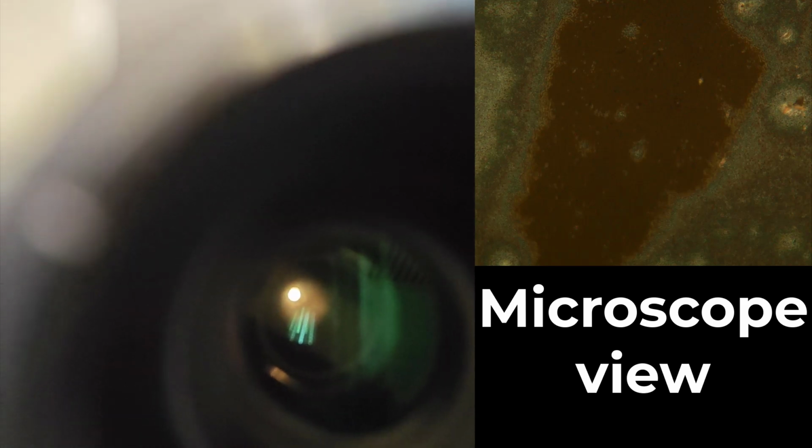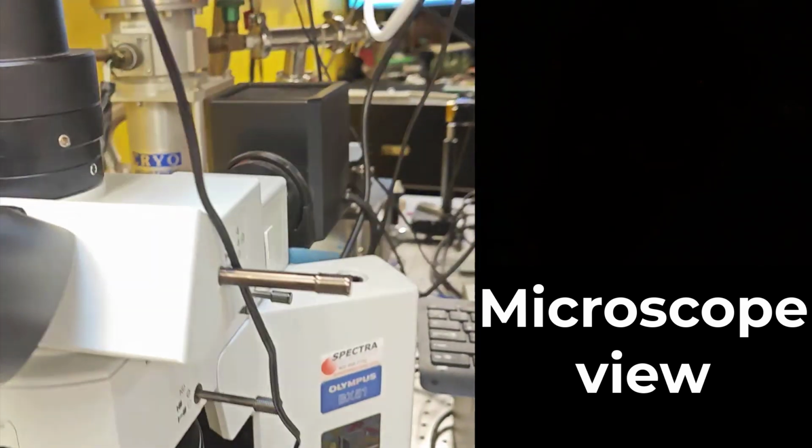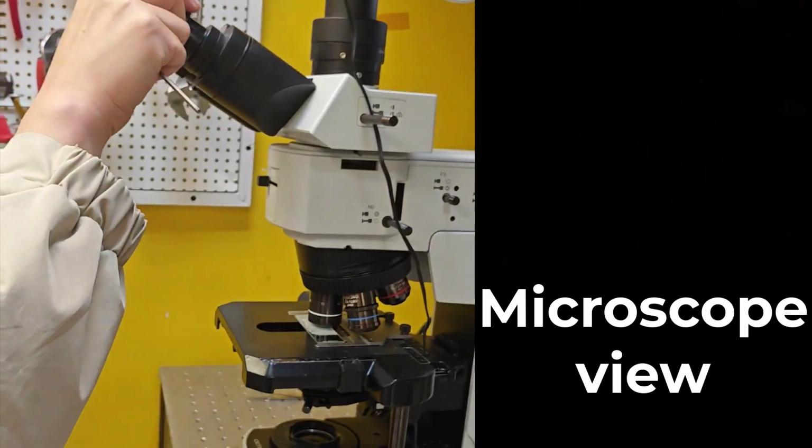You want to adjust the AS and FS so a proper amount of light is illuminated on your sample while the light field just covers your field of view. This reduces the scattering light, offering the best image.